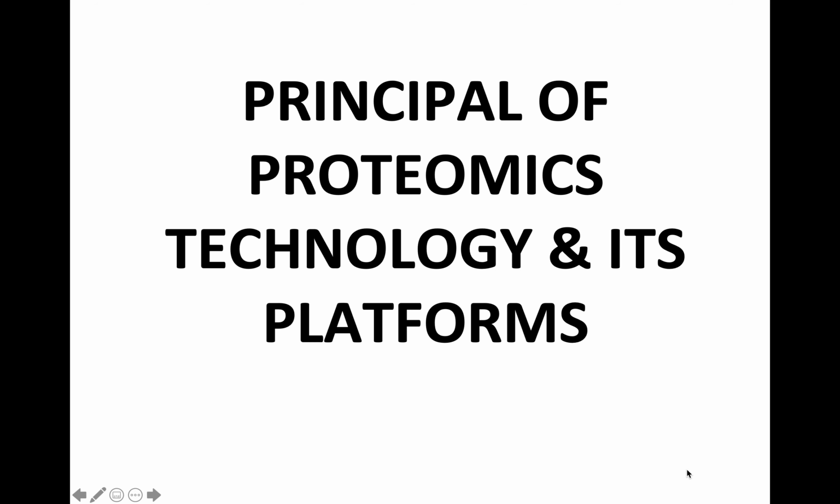So this week we will embark on a new topic, which is on principles of proteomics technology and its platform. Unlike genomics, we don't really have that many platforms. We don't have different generations like generation 2, 2.5, 3 and so forth. So in MS there are a few platforms, but it's basically based on spectrometry, or what we call mass spectrometry.